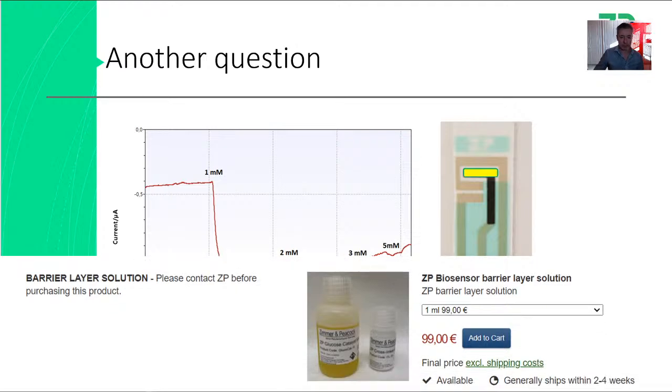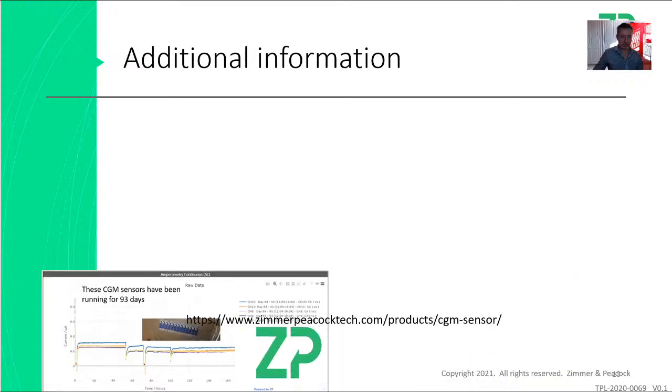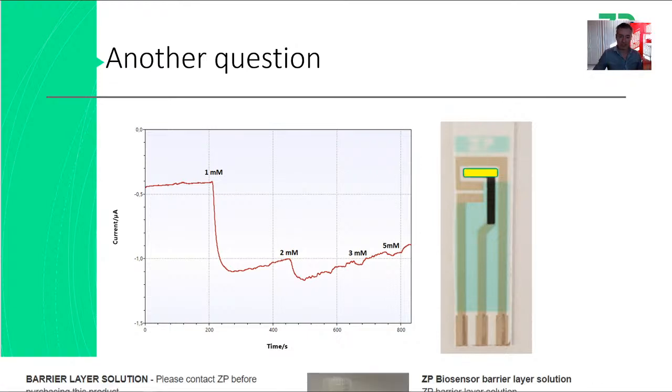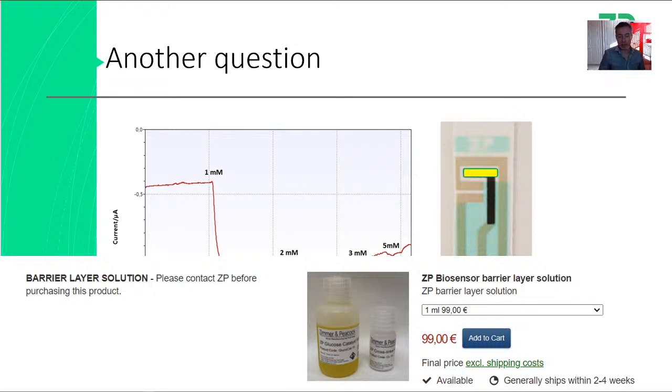Now their question is, how do I get a greater linear range with this catalytic surface sensor? The quick answer is, it's the barrier layer again. If you're making a sensor, especially an enzyme-based sensor, and you seem to be lacking linearity, you have to compromise, and you can get your linearity back by using a barrier layer. You'll get your linearity, but you will also lose signal.